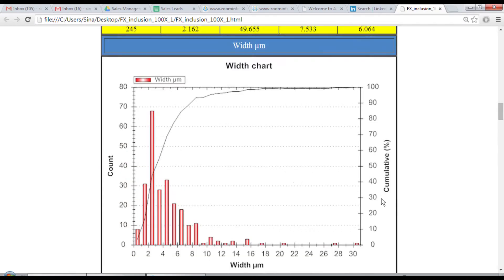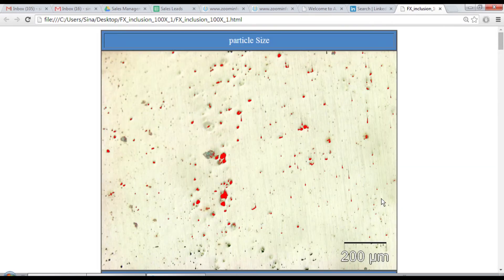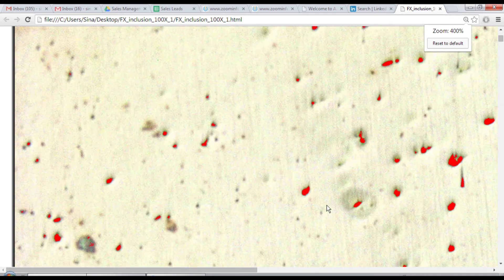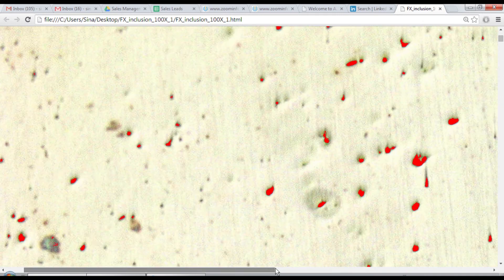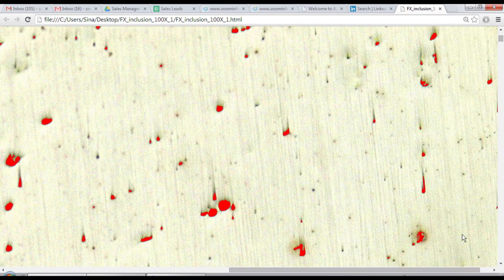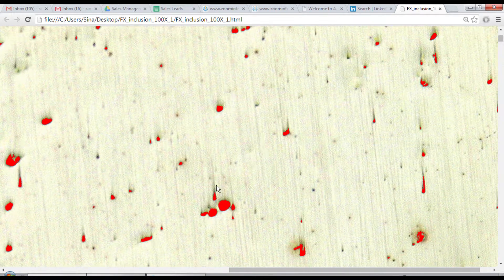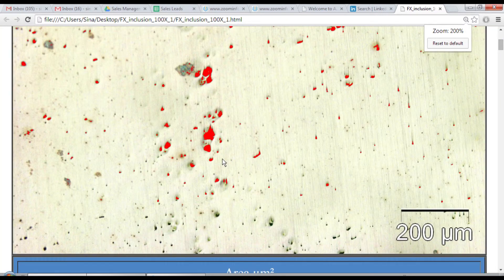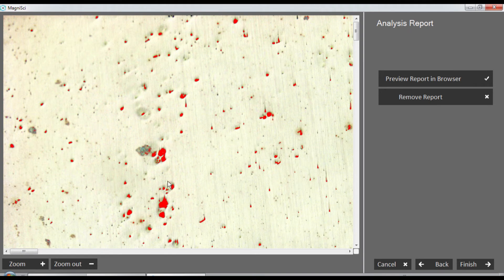If I go closer and have a closer look, I can use my browser zoom option because the report is in the browser. Some of these are of course inaccurate for size detection, but the idea here is to calculate number density, so in this case we would be fine to do the measurement.